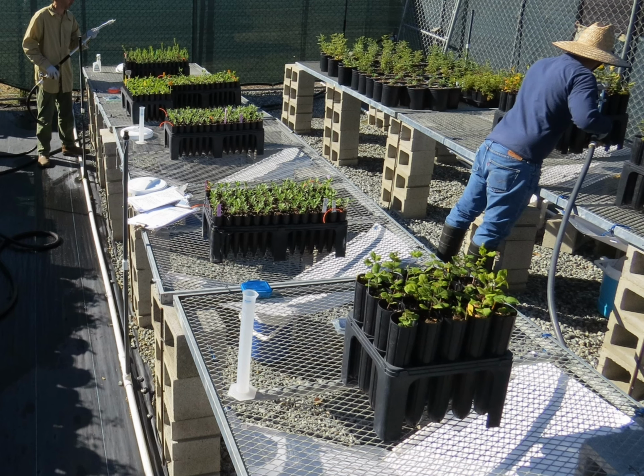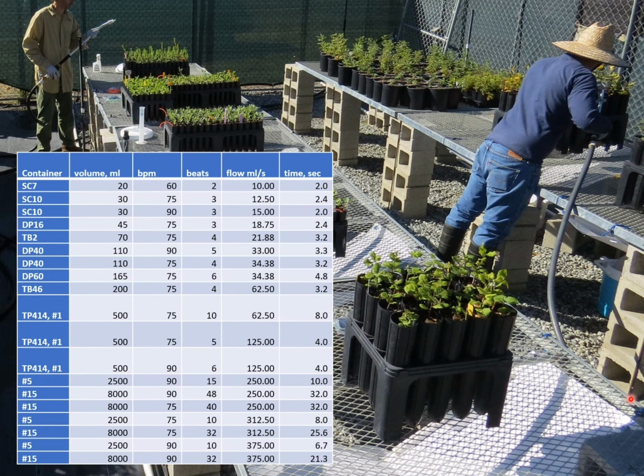If we're testing a lot of different plants, and here we see that we've got several different plant sizes being tested at once in this nursery, what we want to do is figure out timings that are going to work out for each of these different plant groups so that we can organize our testing. On the website also, we've set up some metronome timings for different pot sizes, to give you an idea of how many beats you would need to irrigate things at these different types of flow rates.